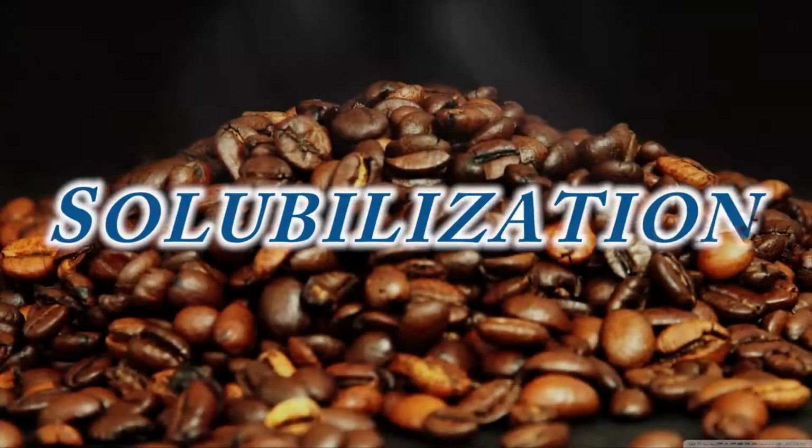So in this video we are going to use the most notorious product that contains caffeine, and we're going to show you a process in order to extract it from it. So let's see it.